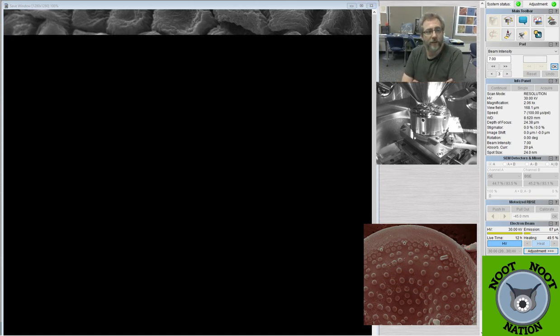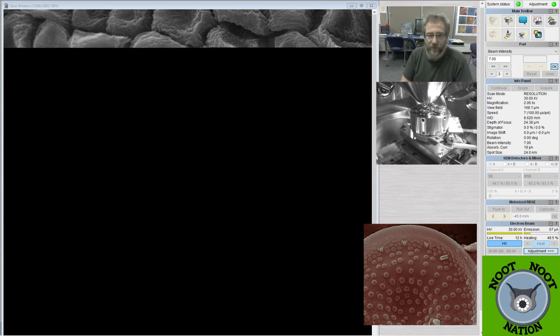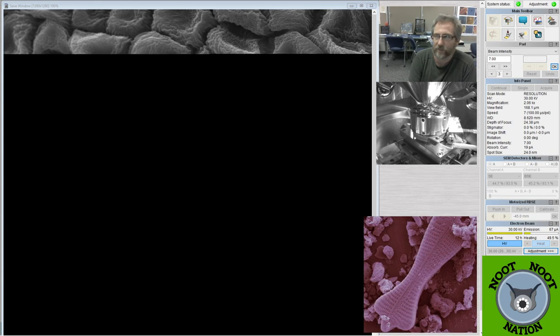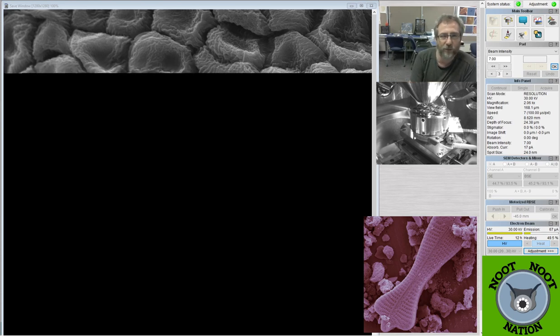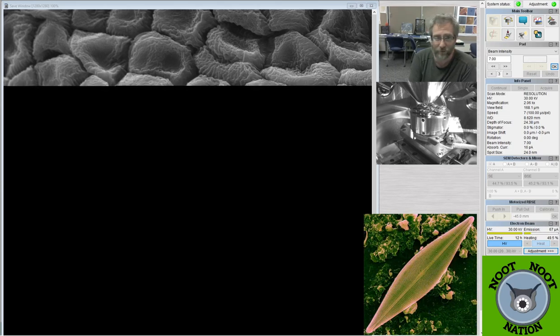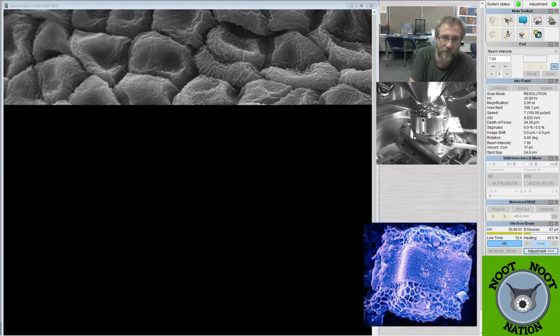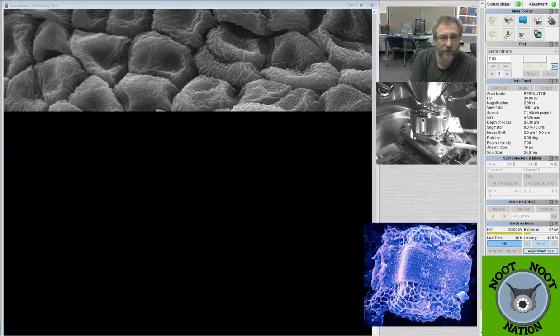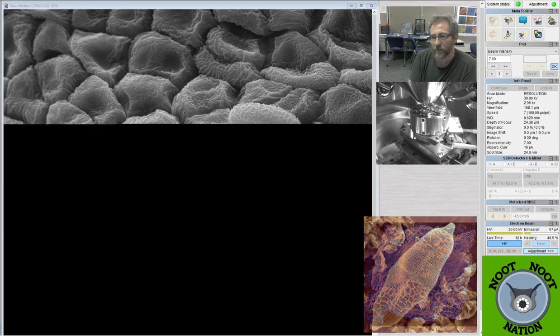What causes the line? Sometimes a piece is at higher elevation and it will start to charge a little bit, and then the line just kind of gets dragged across there. I don't understand the physics of it exactly, but I know if there's a high point that has a lot of charge on it, it causes it to distort the image. Sometimes it's a little bit of water in the sample. These are living, I mean, they were living like 3 hours ago, materials. So there's still a lot of water present in them, and that can cause some disruption when the beam comes across. Also, if they're unevenly coated, although I think these ones are actually pretty well coated with gold.